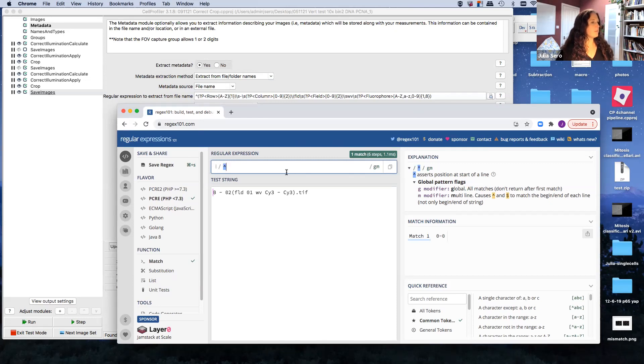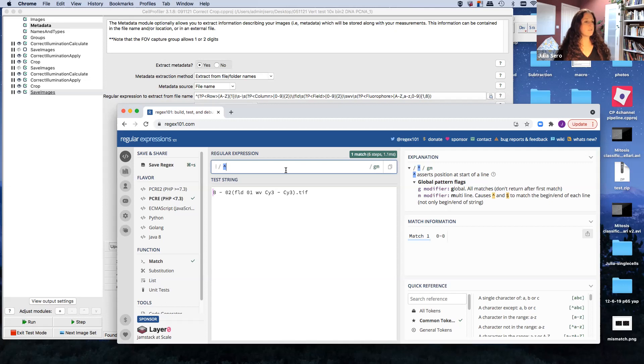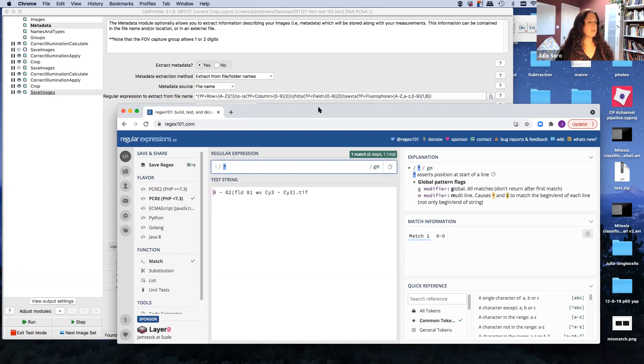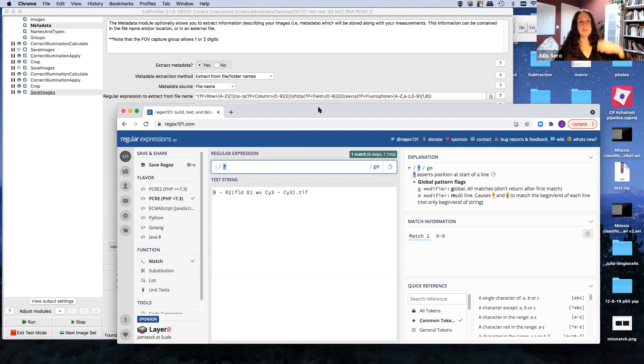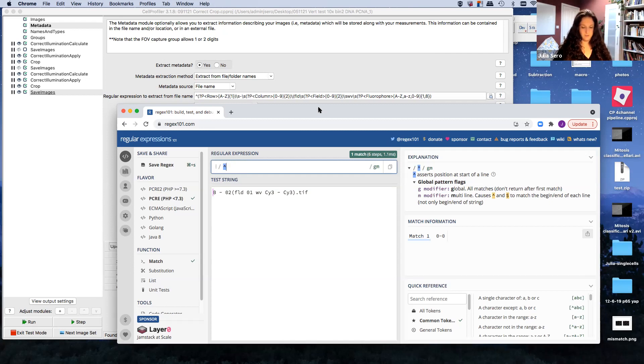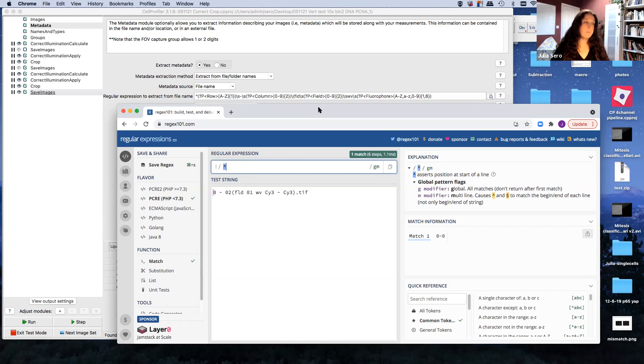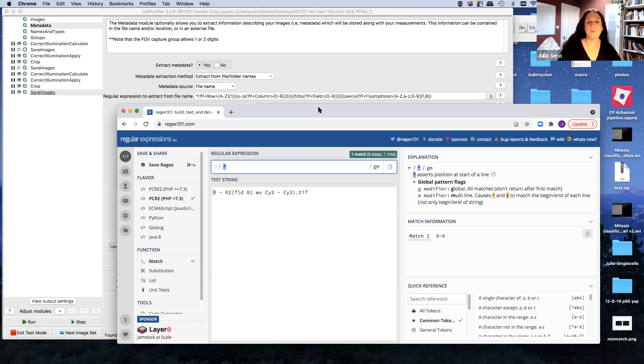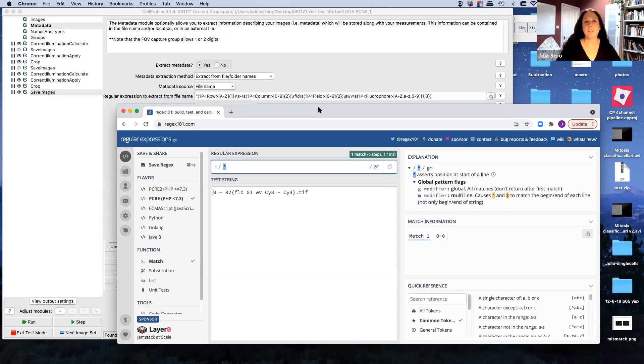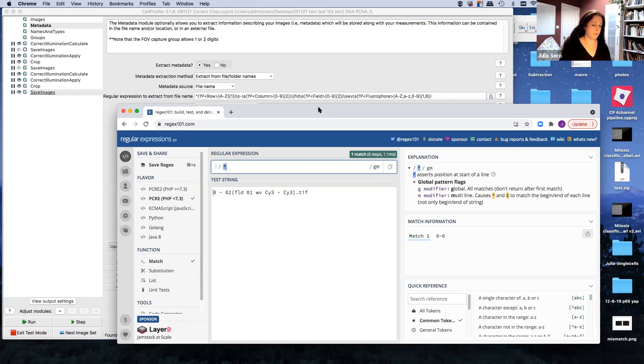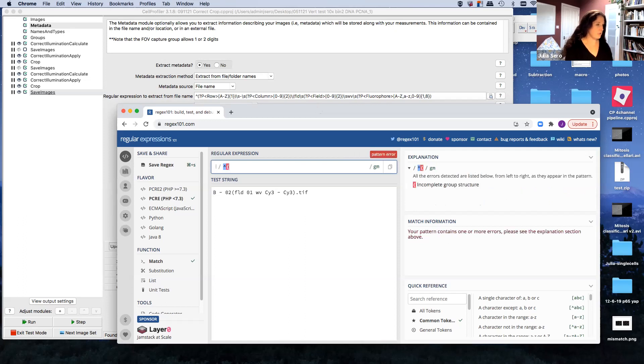And then the first thing we're going to do is define a capture group. So the first thing that we have here in our file name is a B, and that B corresponds to the row. So in a 96-well plate, you'll have A, B, C, D, E, F, G, H, I. In a 384-well plate, it goes all the way up to P. The first thing we need to do is define what's called a capture group. So a capture group, the name suggests, is like a group of symbols that you're going to capture.